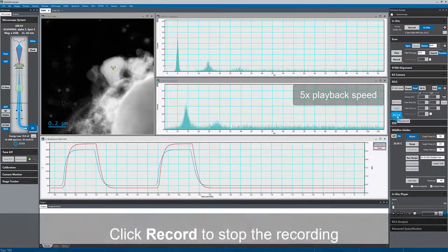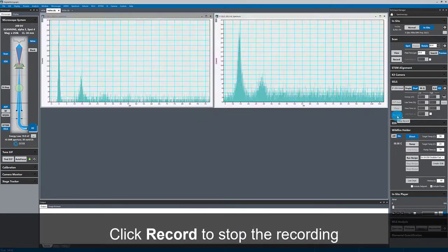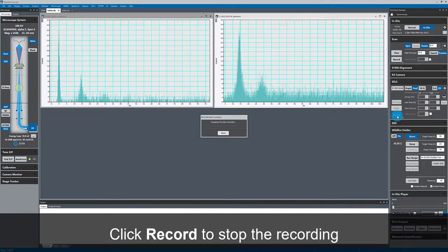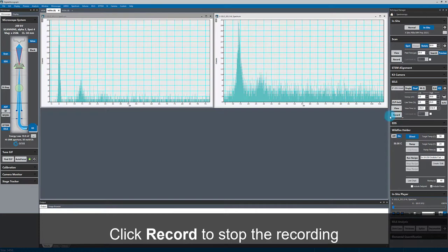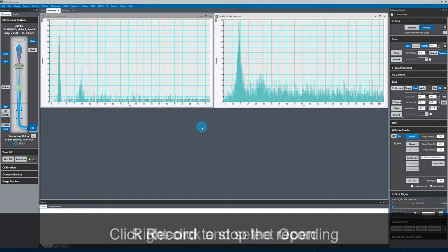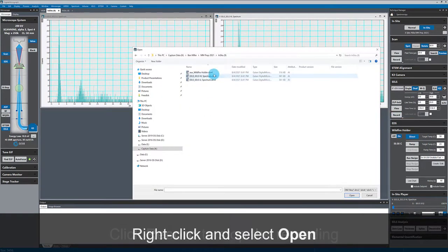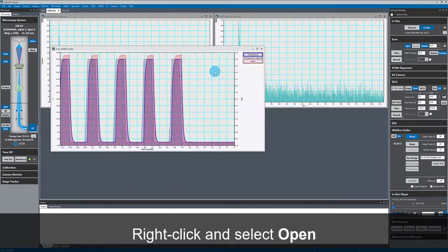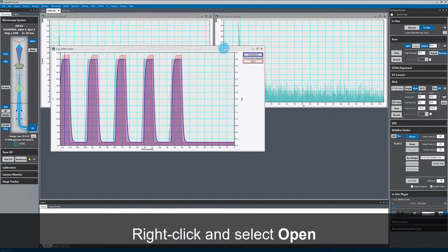So now I'll stop the in-situ EELS recording, and the software automatically captures a high quality dark reference. I can now open the heating holder data, which was saved with my EELS dataset.